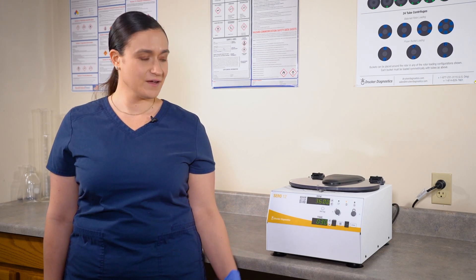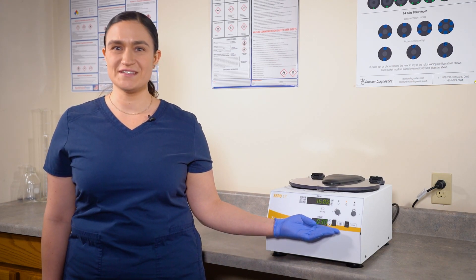Hi, I'm Dawn with Drucker Diagnostics, and today we're going to access the SERO 12 manual using the QR code on the front of the centrifuge.